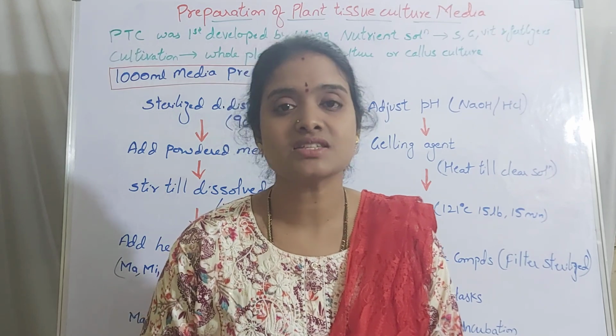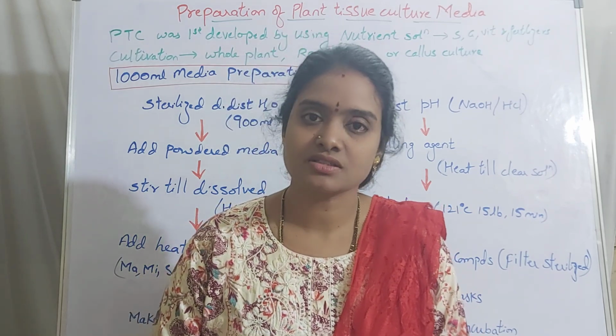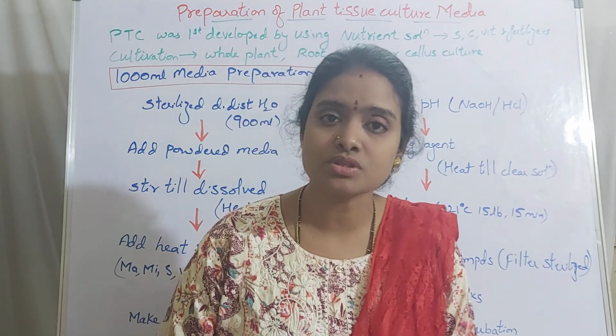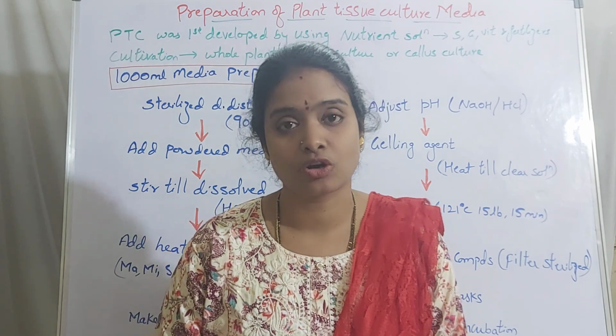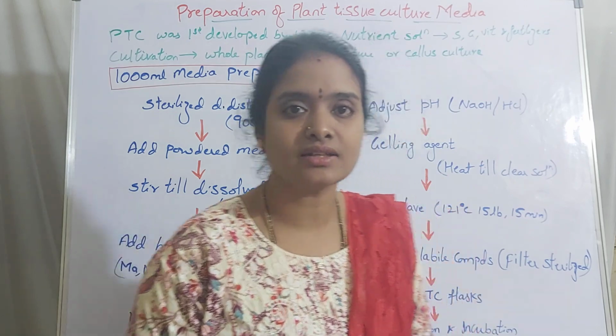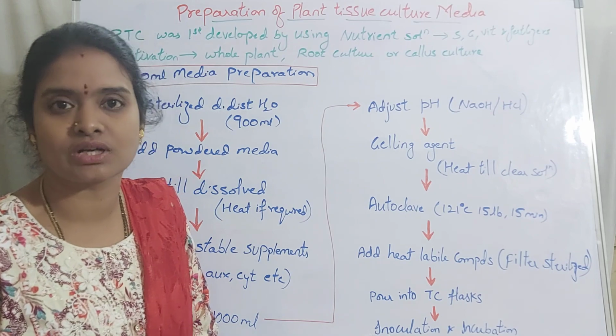Whereas here in plant tissue culture, apart from the fertilizers, that is nitrogen, phosphorus and potassium, you are supposed to provide sucrose and also amino acids because the cells are in shock. So here let us see how we are going to prepare the plant tissue culture media.